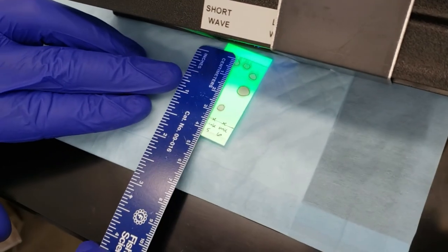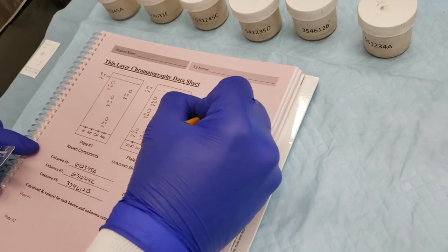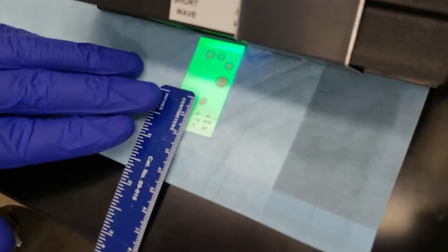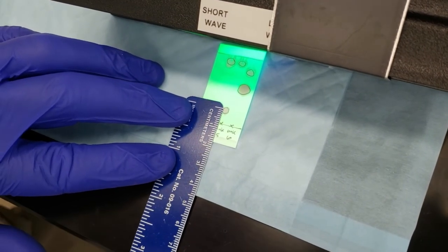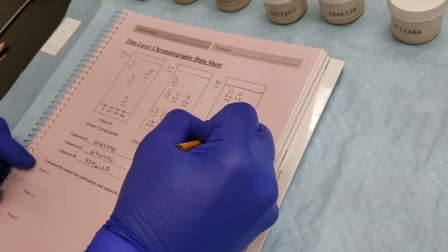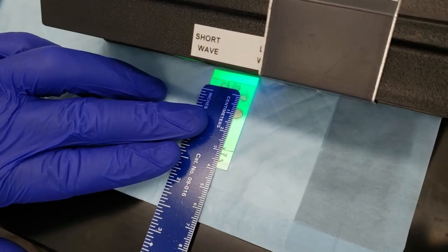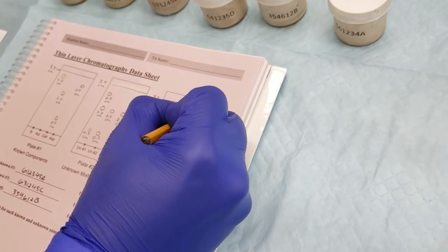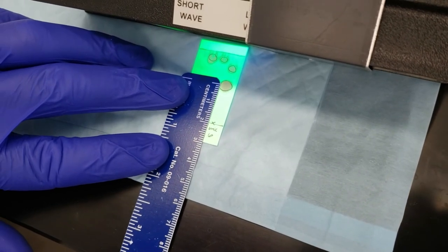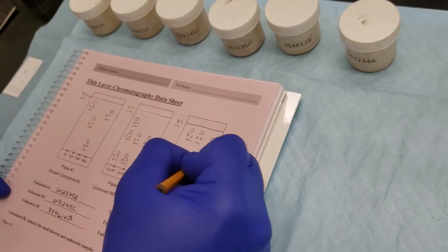For unknown number five, we've actually got two spots. The top spot is 3.2. The bottom spot is right at about 0.8. And that's good for unknown number five. Number six has got two spots. The top spot measures in at 2.9. The bottom spot measures in right at 2, so 2.0 centimeters.